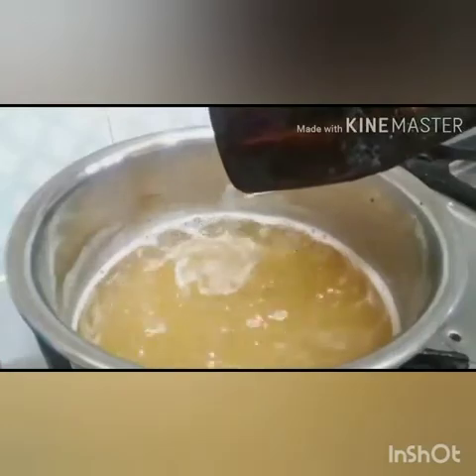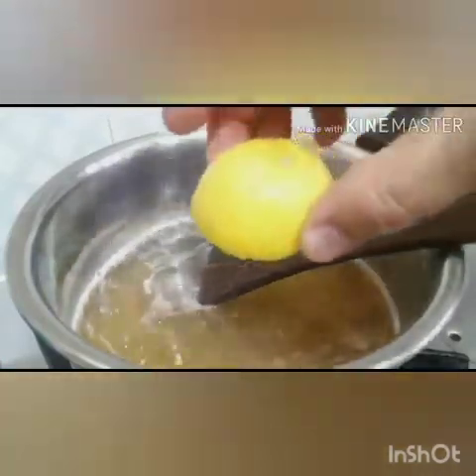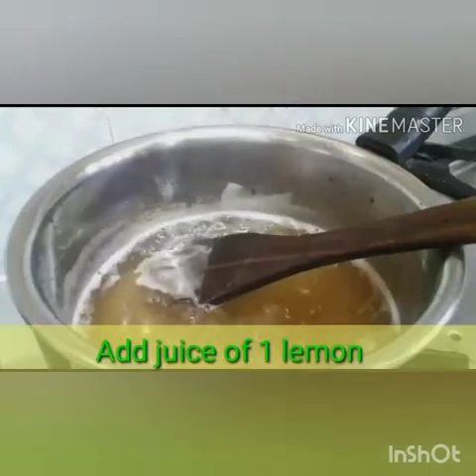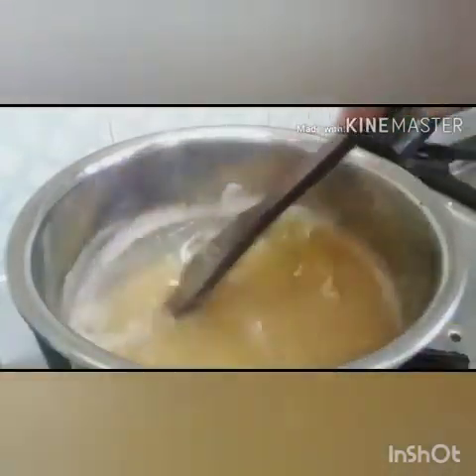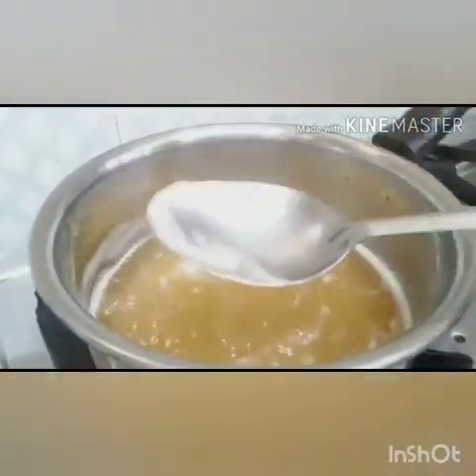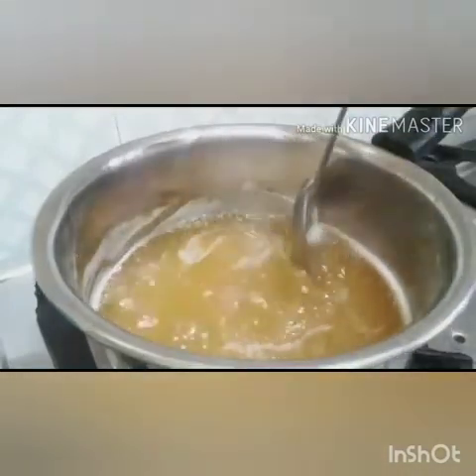We will boil it further for the perfect consistency of jelly. Now we are adding citric acid — we can also use it in powder form, in which case we will have to add 3 grams of citric acid. As we can see, some scum has formed on the top, so we will have to remove it in order to obtain a clear jelly.